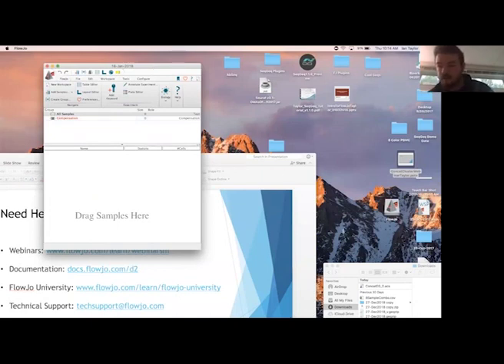I'm getting a question from one of the listeners. Is t-SNE computed after logical transform? That's a really good question, actually. You should have your scaling set before doing any gating or t-SNE calculations. That's absolutely required, because the transformed data is what the t-SNE algorithm is going to utilize when completing the mapping. So if your data is incorrectly scaled when you do the mapping, you're very likely to get an improper mapping.